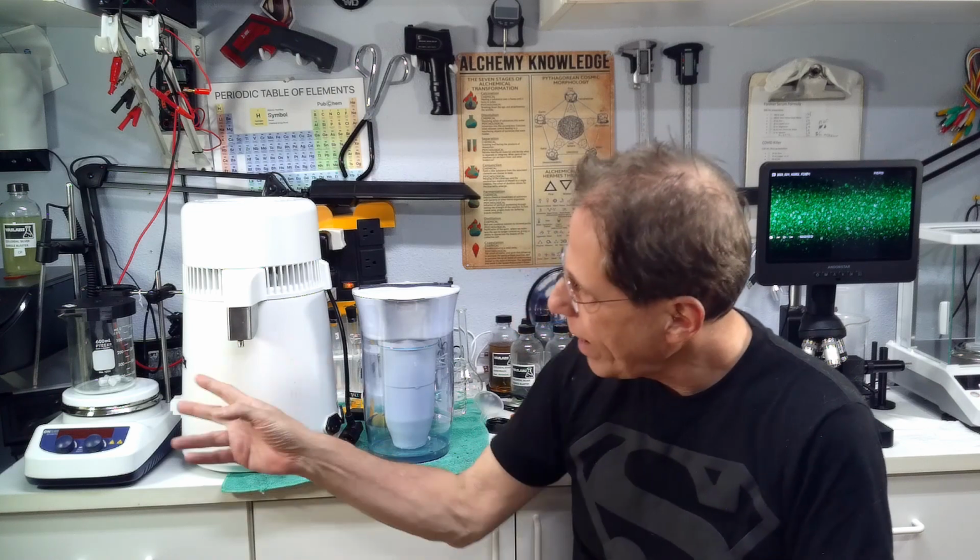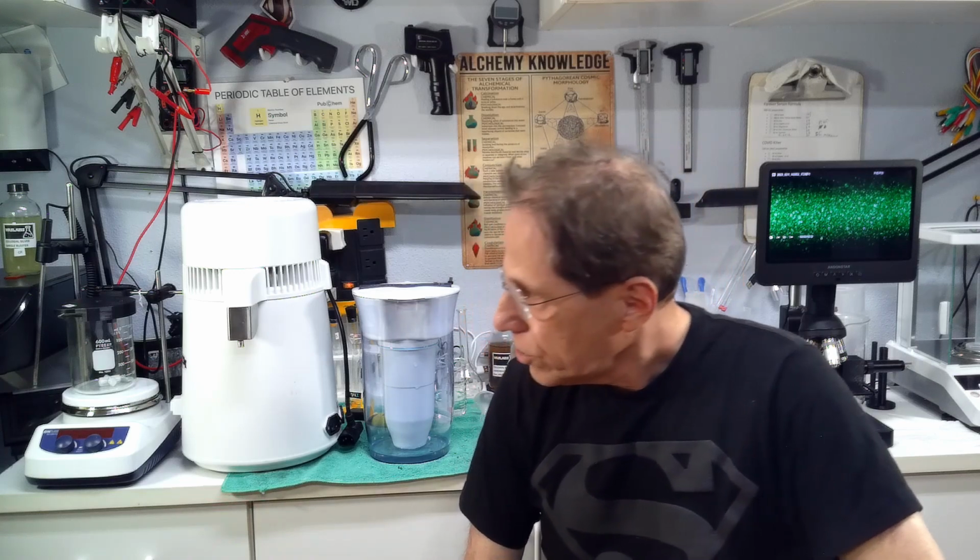So some of the stuff that you have in your house, like maybe vaporizers or medical equipment, may require distilled water or RO water or Zero Water to work, and then you have to get the appropriate water. But let's talk about stuff like that. In the lab here, when we cook colloidals, we need 0 parts per million water, or as close as possible to 0 parts per million, but that's just a general rule. So there are various ways to achieve that.